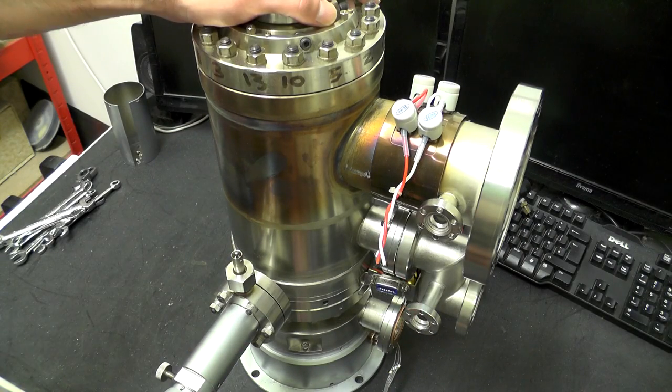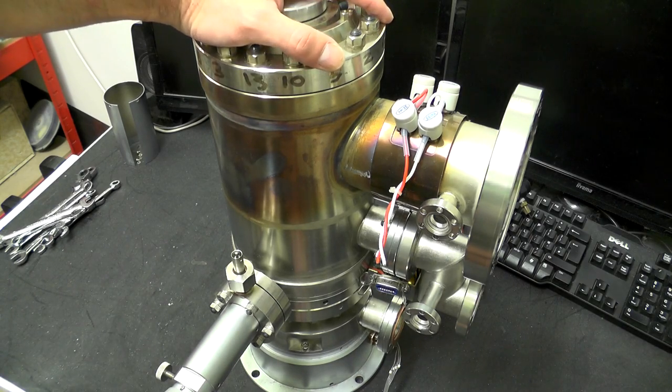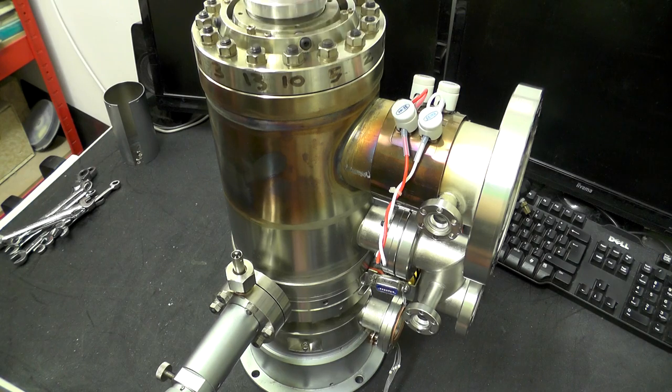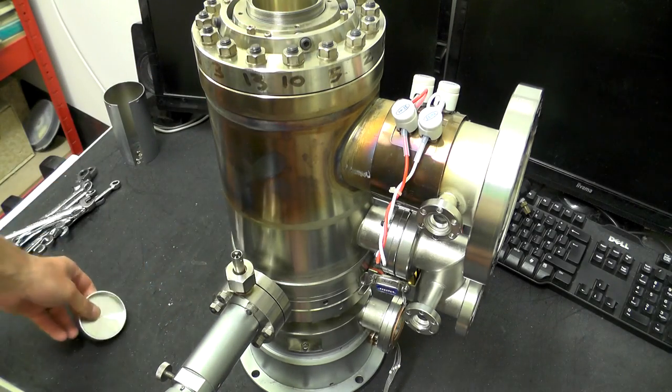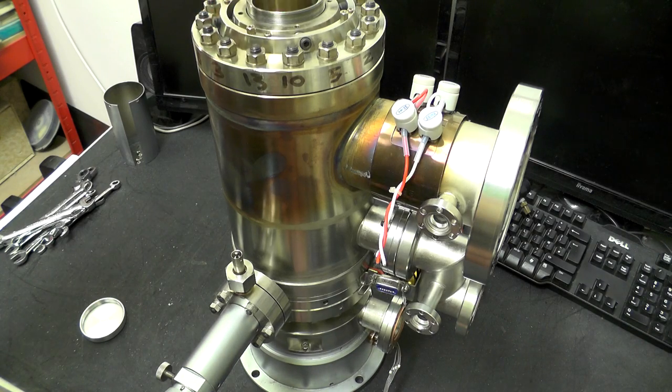Looking at the column from top to bottom, right at the top we have the electron gun itself. The connections for the electron gun would have been under this cap — quite a long thread. This is obviously just a protective cover. In there, a large connector would have gone in with all the high voltage connections, plugged into a few terminals down in the base.